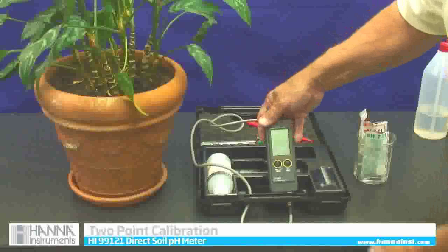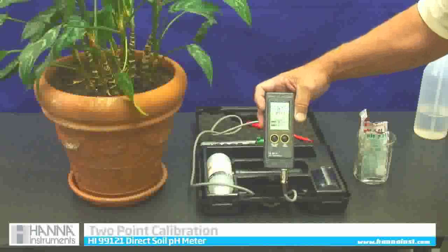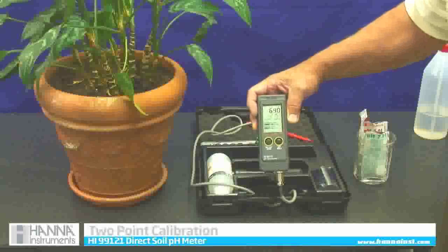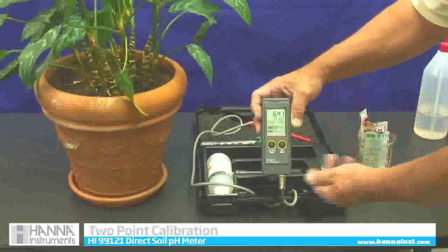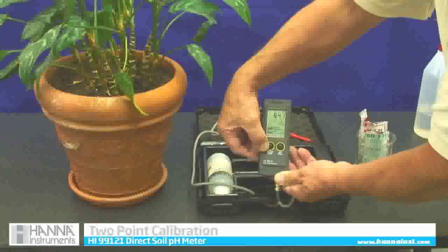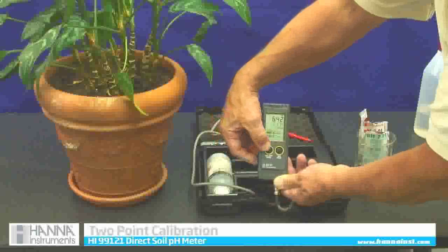I am going to push the on/off button once to get it on. The screen will read something like 6.4. Now I am in on mode. To get into calibration mode, I am going to depress that same on/off button until CAL pops up — I will go past off.